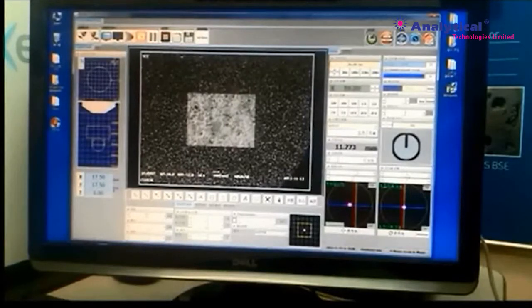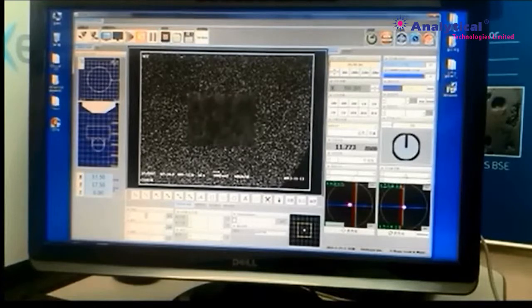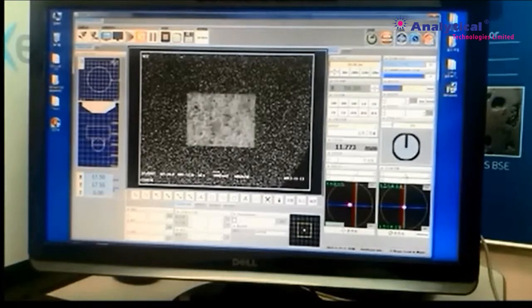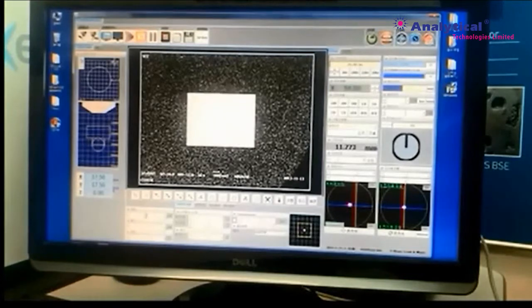After aligning the gun hardware is over, we need to align the gun align UI. We will now begin the gun align UI. Change the x-axis electron gun value on the lower right-hand corner of the software to find the brightest location. Change the value for the y-axis also.